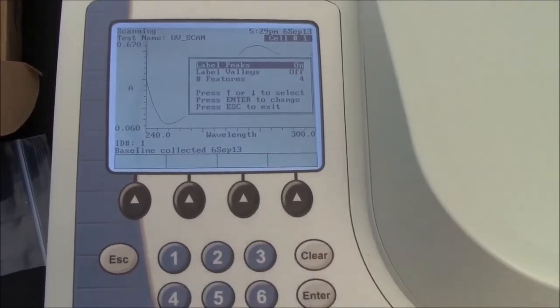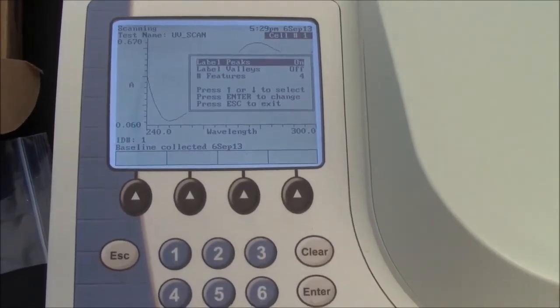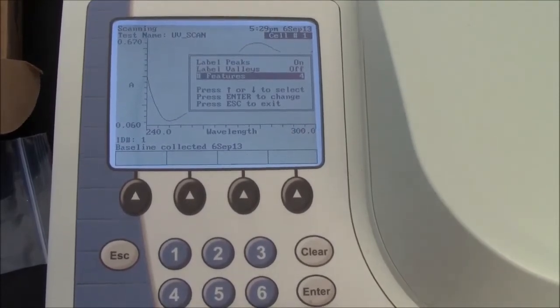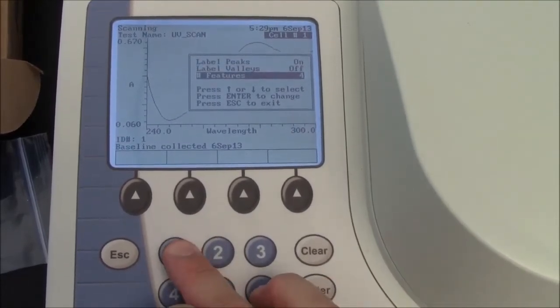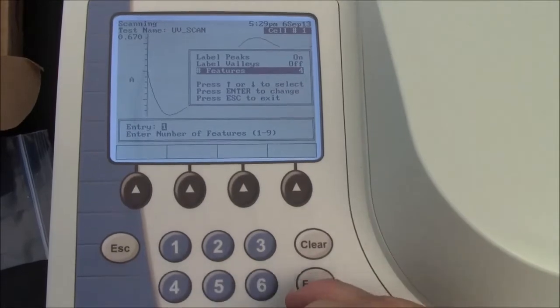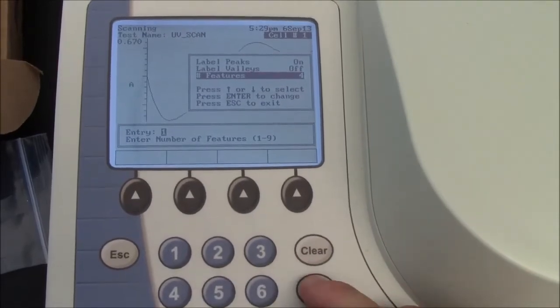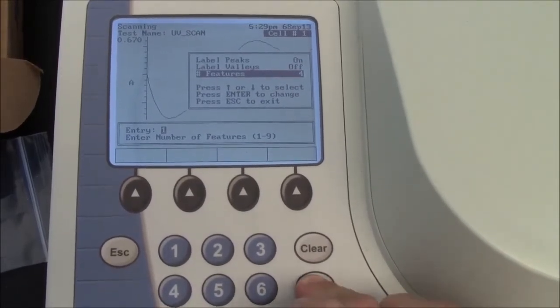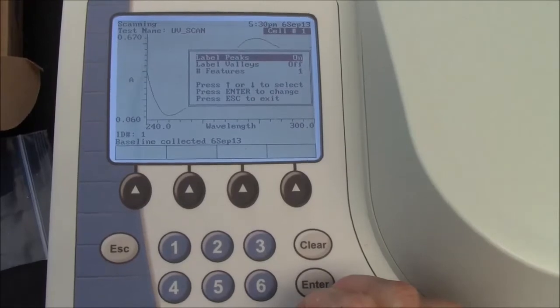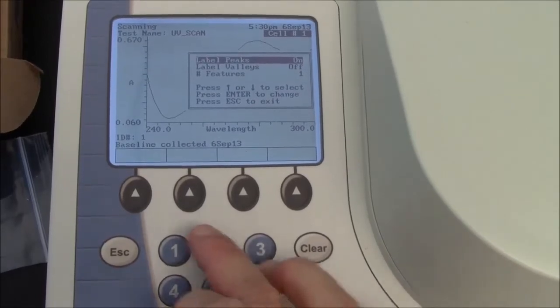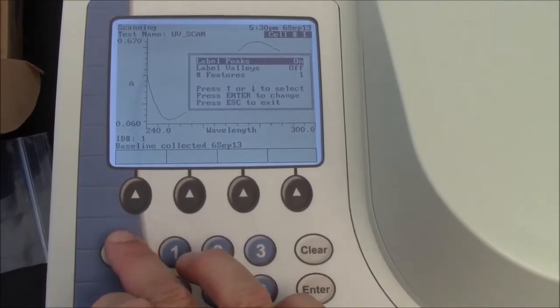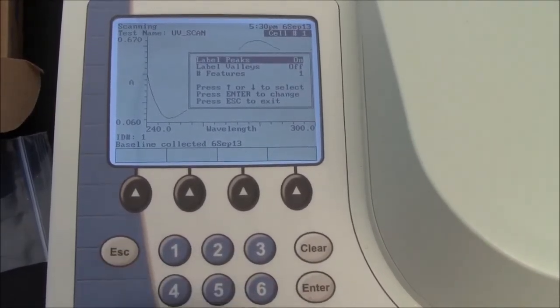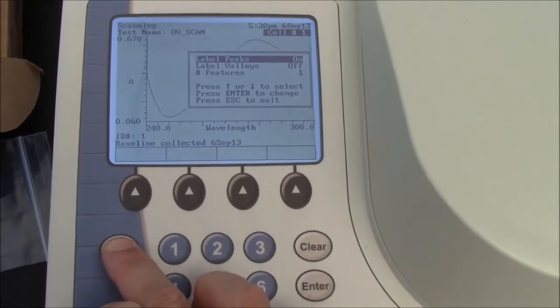How many features? In this case I'm looking for just one. But if I had four peaks I would look for four features. I press escape here and it should label my peaks.